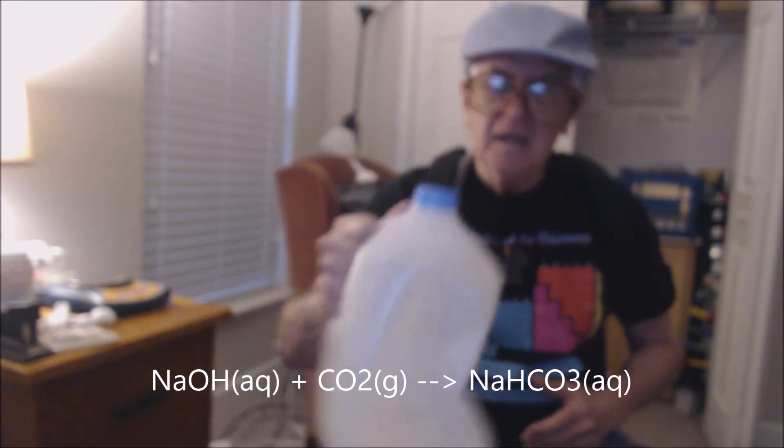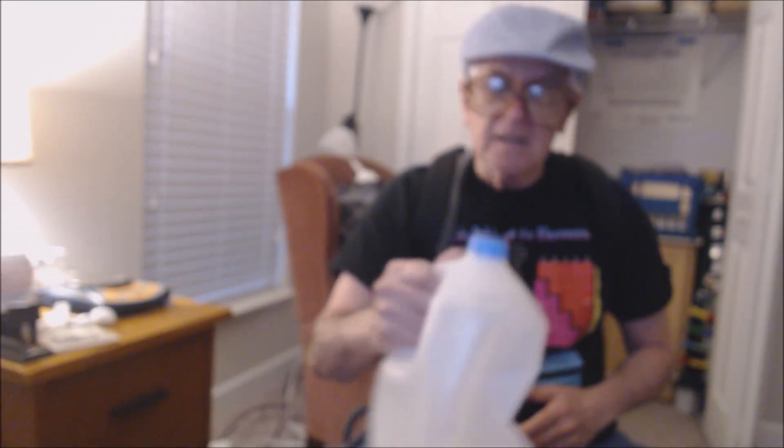Hydroxide ion plus carbon dioxide yields bicarbonate. As it takes the gas phase away and converts it to a condensed phase, there's a partial vacuum up here and the atmosphere closes in on it — you can see it's collapsing. It's changing to bicarbonate: NaOH plus CO₂ yields HCO₃⁻.